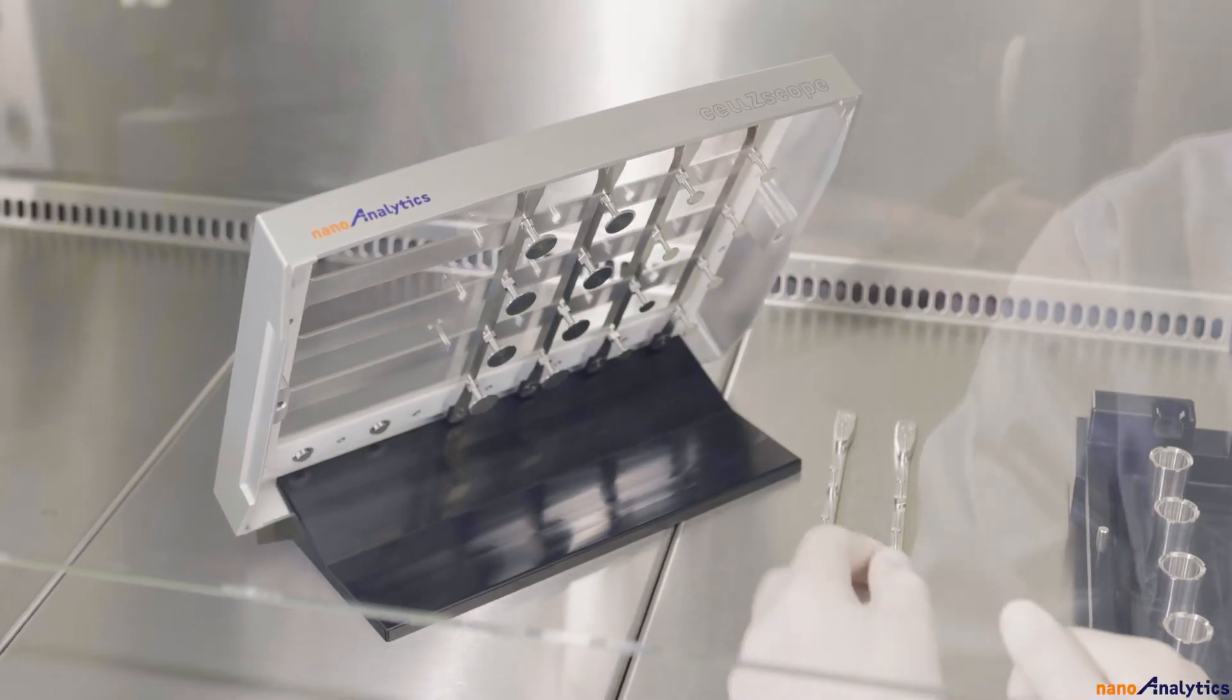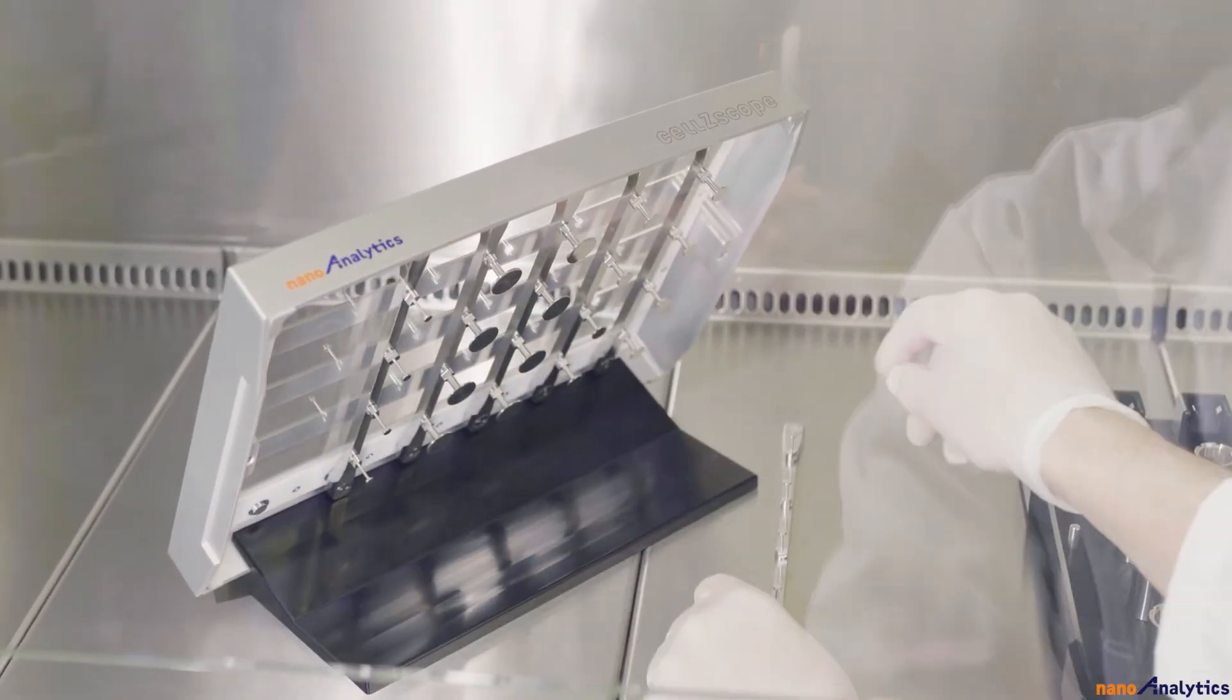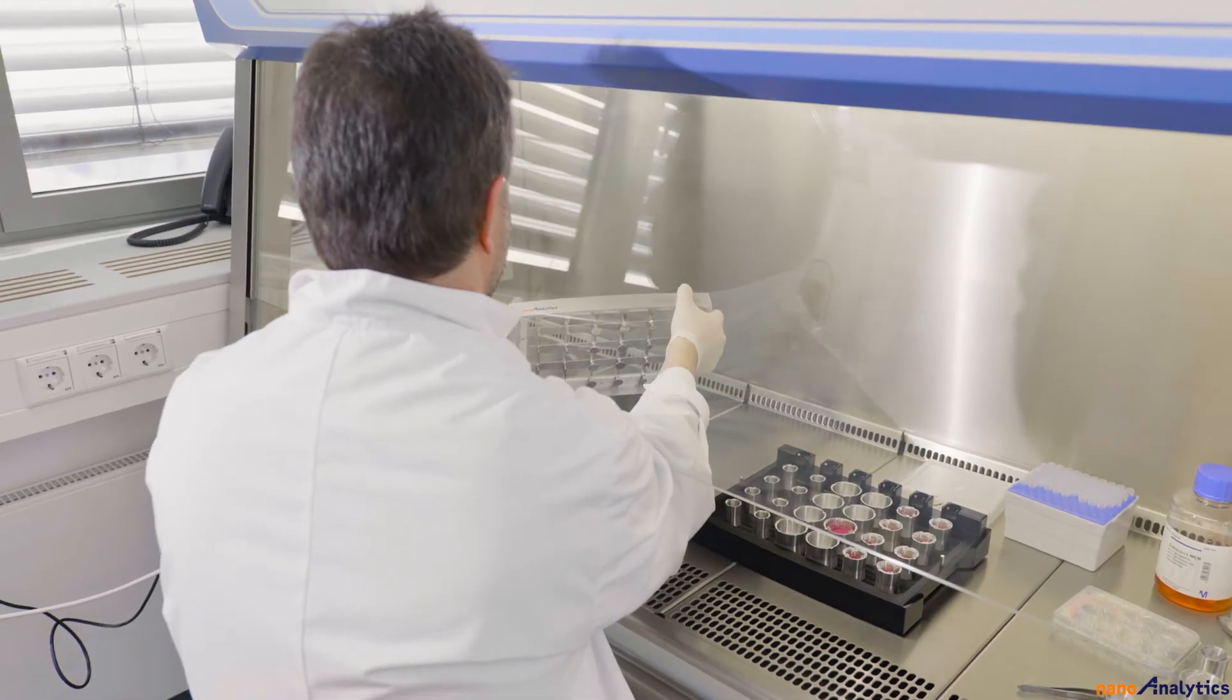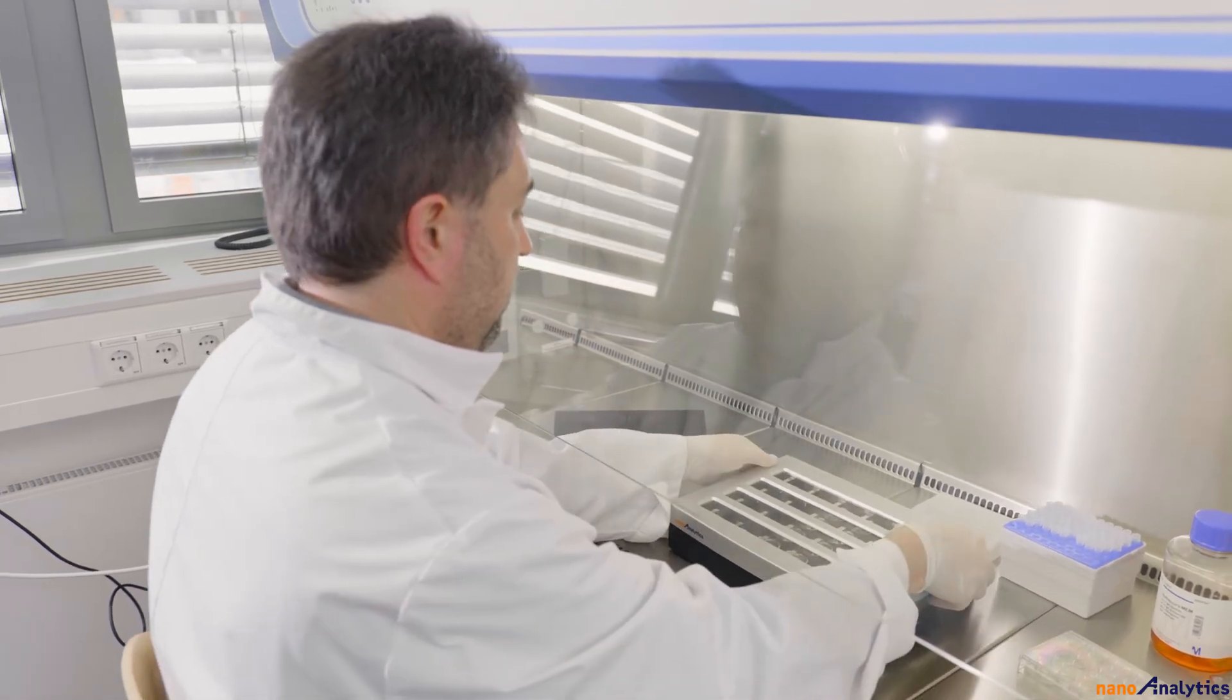The innovative design of the lid stands out with its high user-friendliness, making handling of the upper electrodes quick and easy. The CellModule provides investigators full apical and basolateral access to all wells.